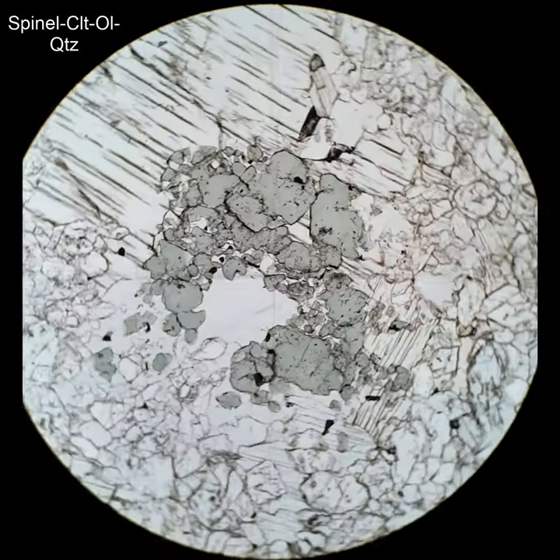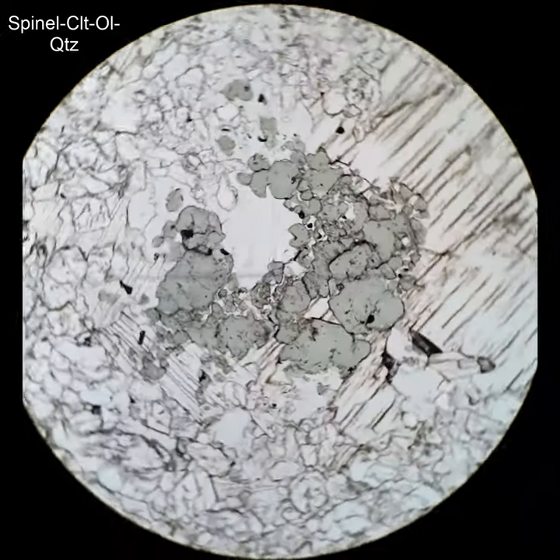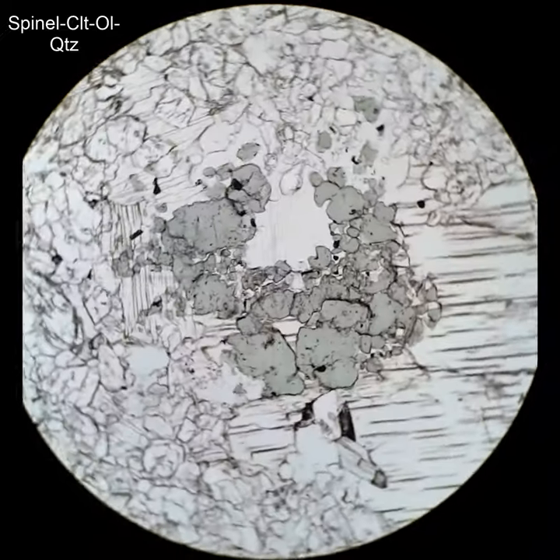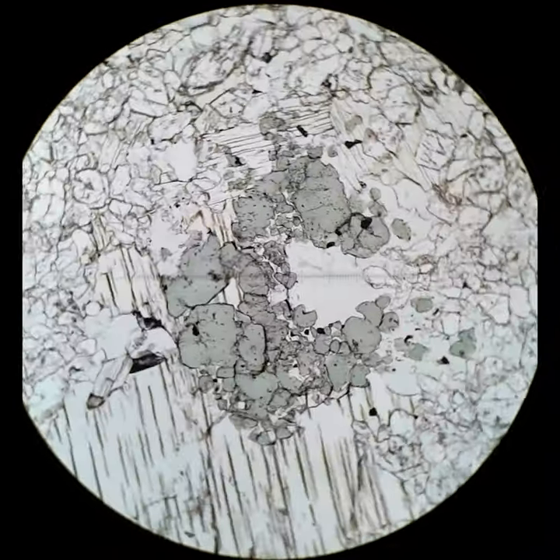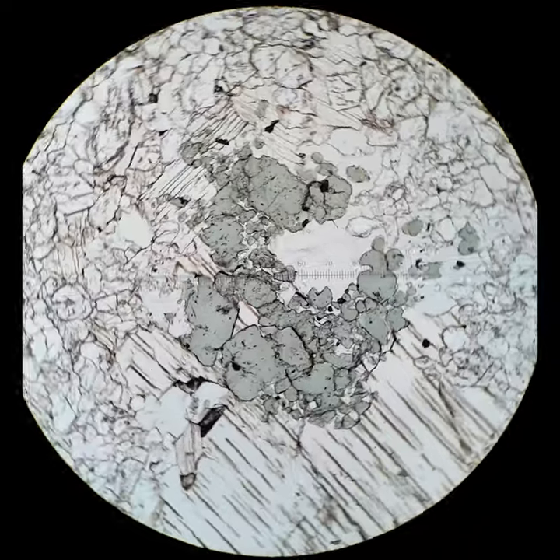This shows a cluster of spinel crystals, paler green than the ones that we saw before, but again when I cross the polars you'll see they just are black.